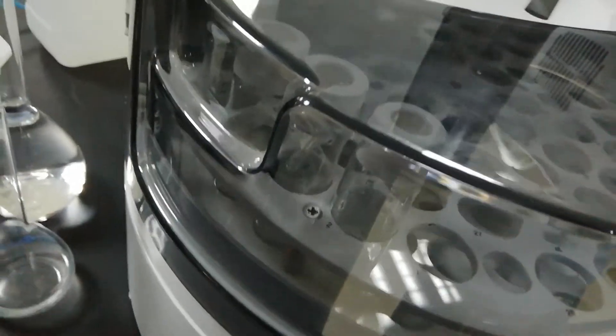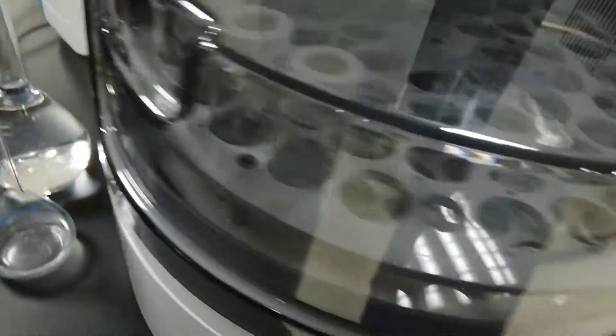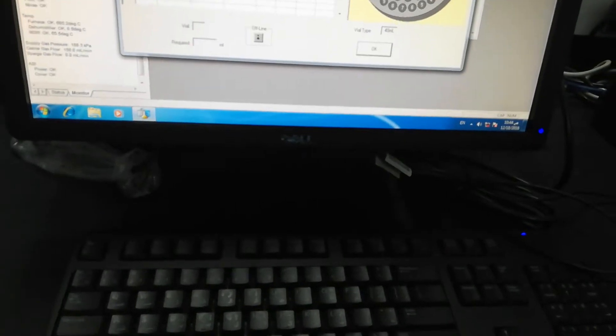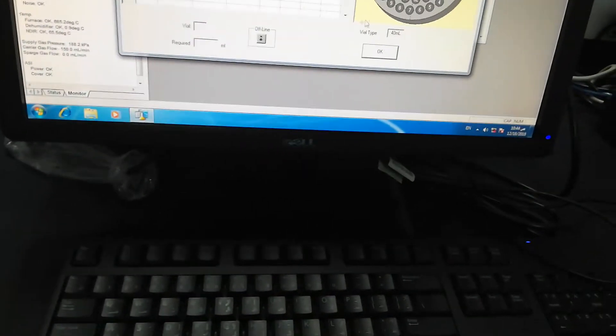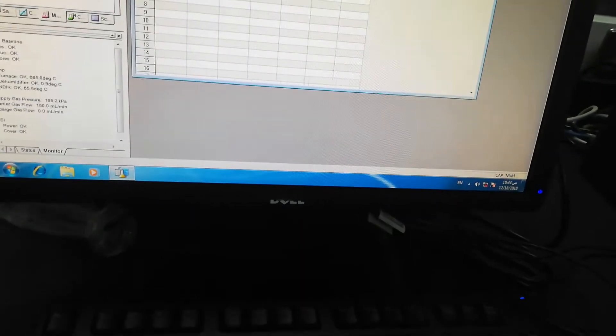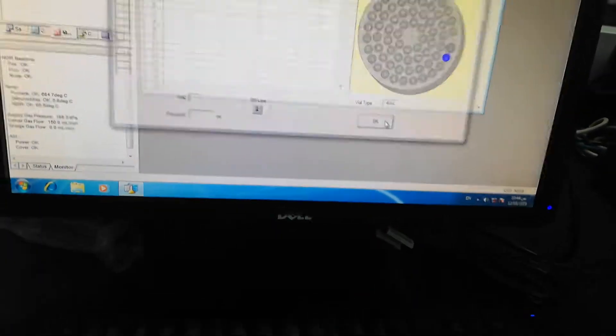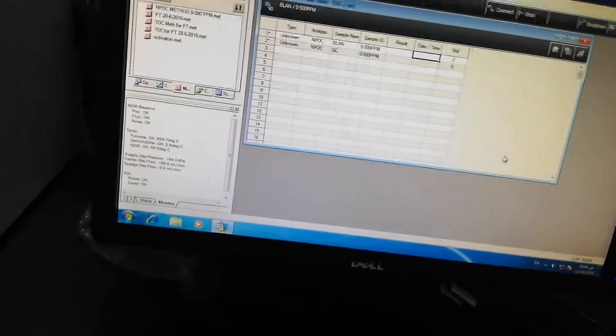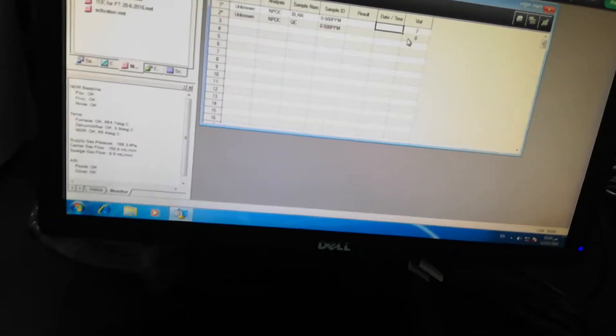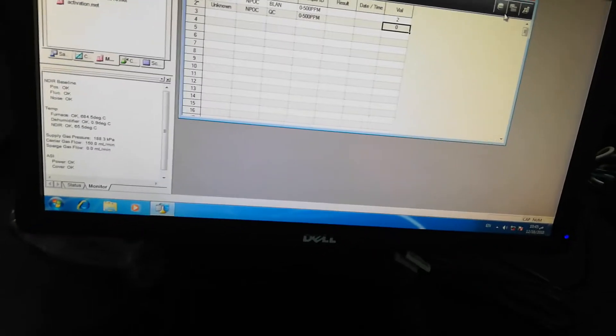I will just use it, so here... you can write it here. Okay, so now you can see, as you have entered, there is vial 2. It is okay. Now what you can do, now you have done for this, so same like for the second, it is vial 3.